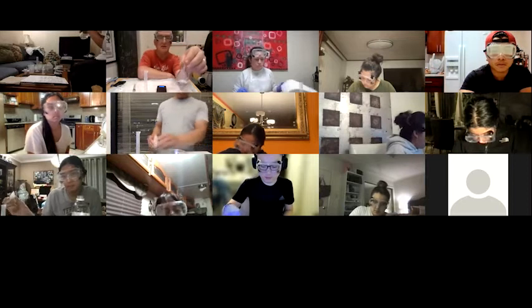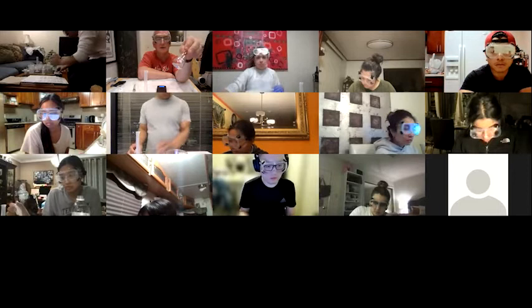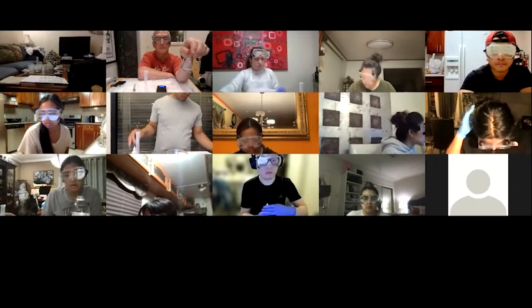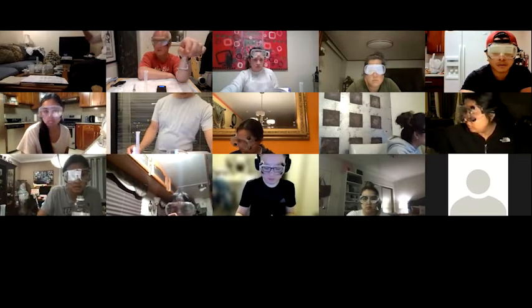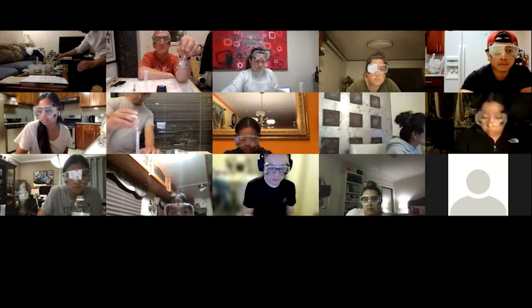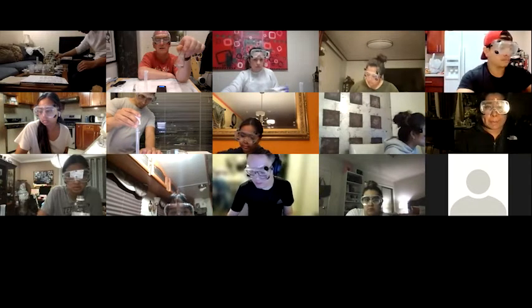When is my titration over? When something equals something else. What are the two things that have to equal each other? Molar concentration? Nope. I can use whatever molar concentration of sodium hydroxide I want. It makes no difference. So it's not concentration. Is it volume? Is it when my volume of base equals volume of acid? Is that when the titration's over?